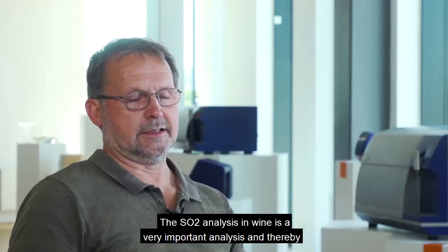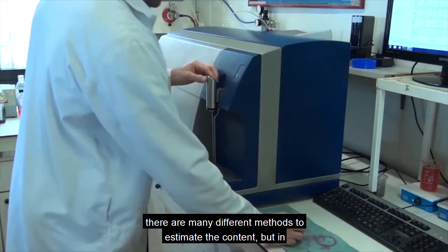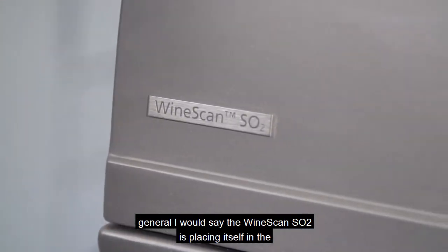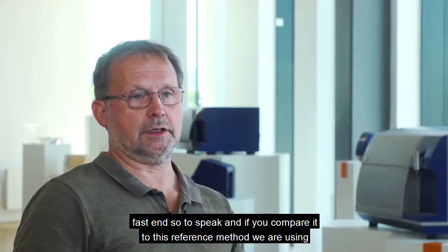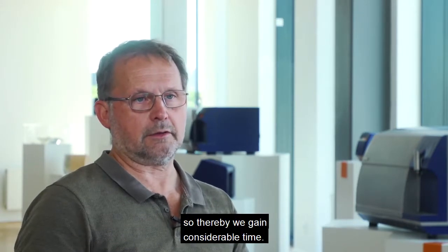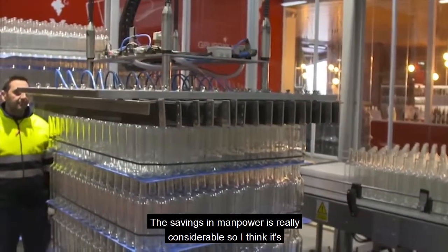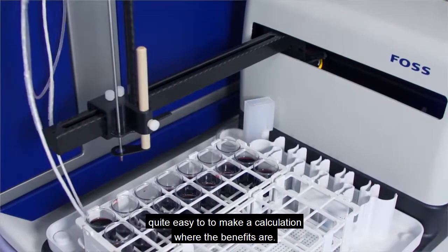The SO2 analysis in wine is a very important analysis, and thereby there are many different methods to estimate the content. But in general, the Winescan SO2 is placing itself in the fast end, so to speak. If you compare it to the reference method we are using, which is called the aeration-oxidation method, it takes 2 times 15 minutes, so thereby we are gaining considerable time. The savings in manpower are really considerable, and it's quite easy to make a calculation where the benefits are.